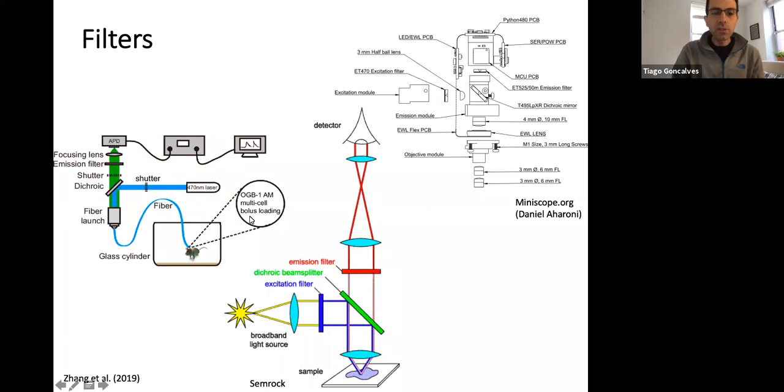And all of these approaches require management of spectra. You have GCaMP, which is green, and very often you have a co-label. And this applies to fiber photometry, to regular epifluorescence microscopy, to miniscopes. You have filters, you have an excitation light to excite your fluorophore. You have a dichroic and emission filters, very often also an excitation filter. You pump the excitation line into your sample, and then you get a signal back, but you need to filter out your excitation light. So you do not want to have your excitation light in your image, right?